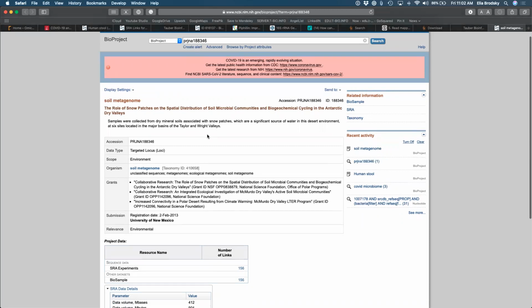Okay, great. So what kind of a project is it? What kind of sequencing is this? Right, so Dr. Varka, that's what we are going to look at today, is how to think about what type of analysis could be done with this data.